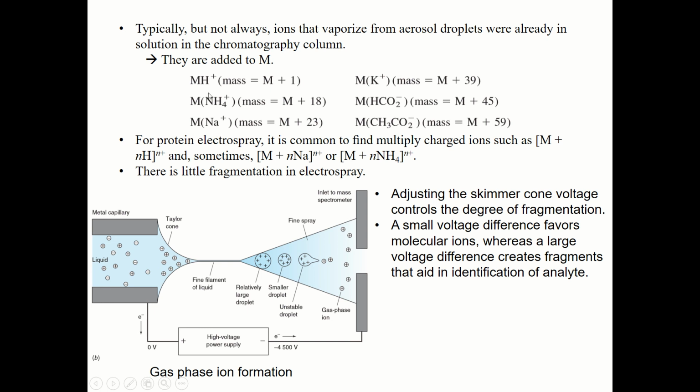You see, these sodium, ammonium and potassium ions are very common, right? Even in air, there are sodium or potassium or ammonium or hydrogen or proton ions, okay? So when you interpret the mass spectrum, you have to consider whether it may contain the proton or ammonium or sodium. Although at first you may wonder why the molecular mass is different, that's because the molecule contains these additional ions.